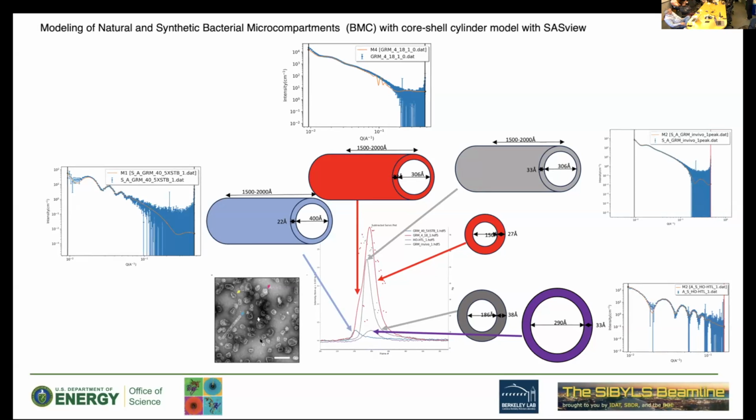You know, it's going to be some handmade models. And you can come up with those 2 cases or 3 cases that you have in your mind. And if you can save it as a PDB, then you can zip it and put it in a Fox and see which model is right or closer.